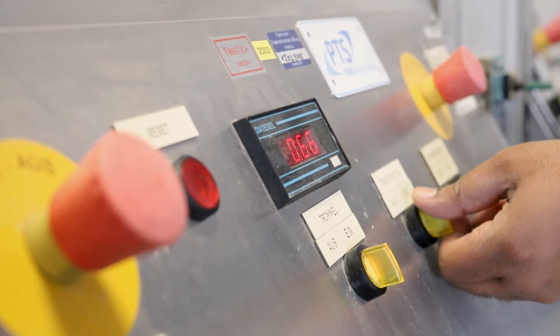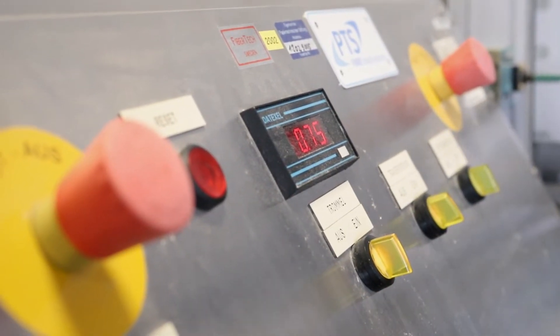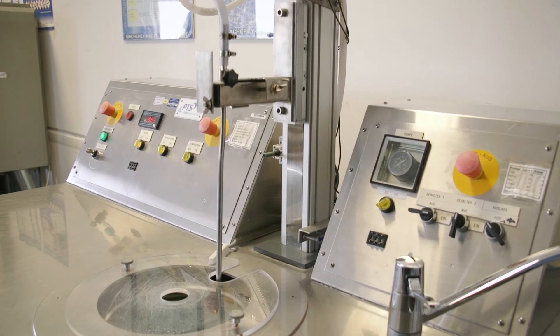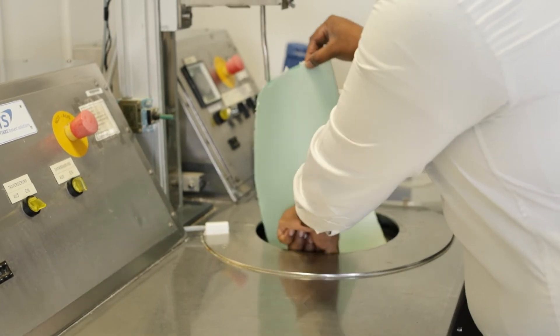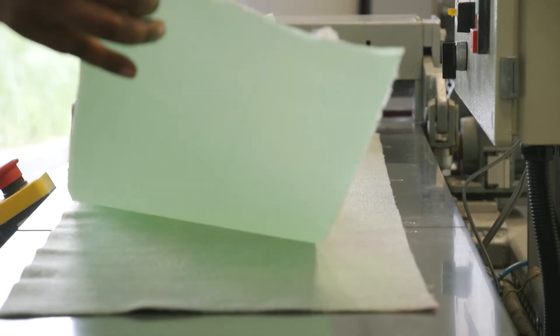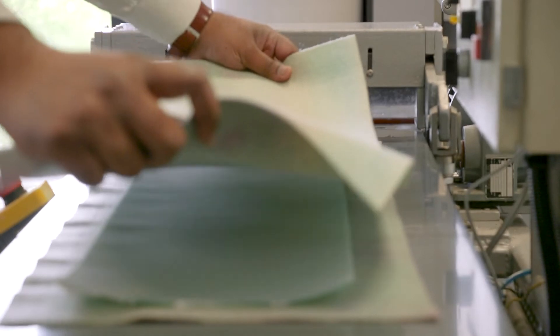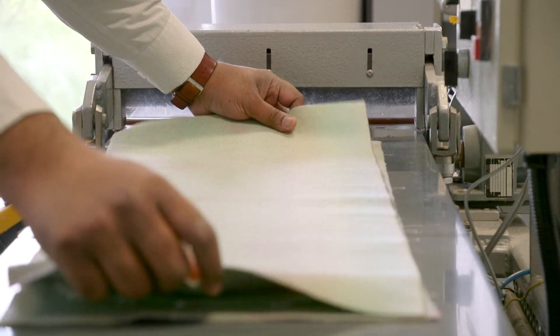Depending on the project, we also use our dynamic sheetformer where we can adjust the MD-CD ratio as well as the basis weight. The influences of refining and fiber blends can thus be investigated more realistically.